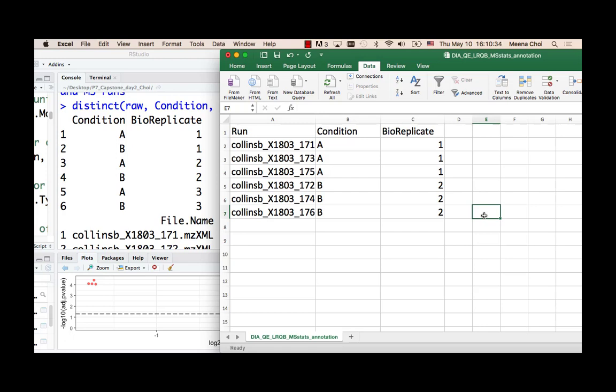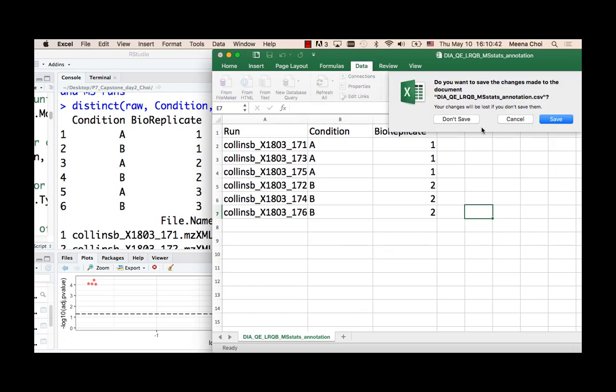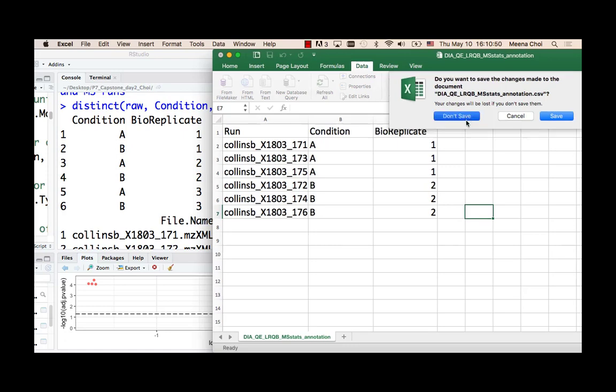So I think I can give you 20 minutes. We have another new data set, right? It will be quite similar; the only change is the input, and you can also compare how much is different.